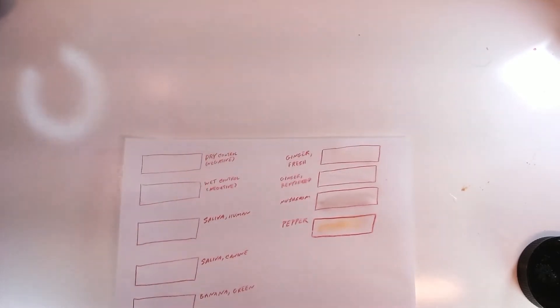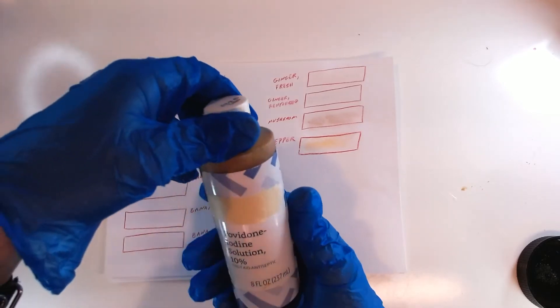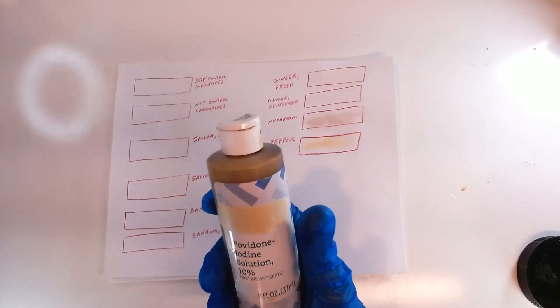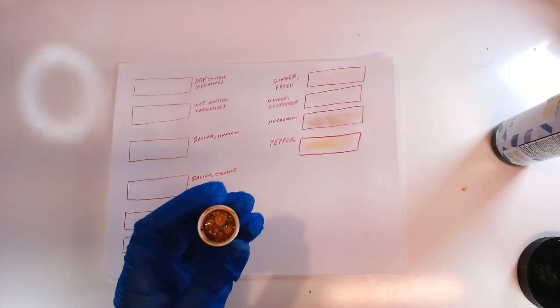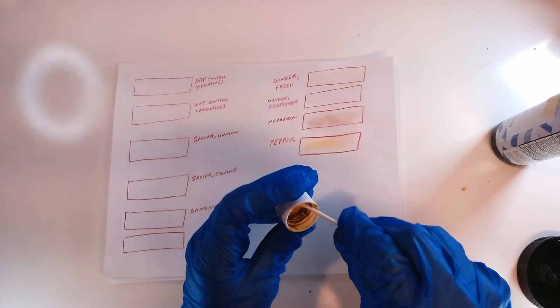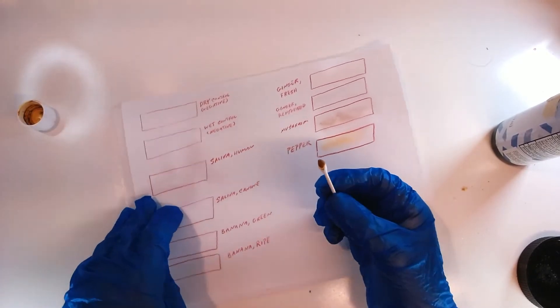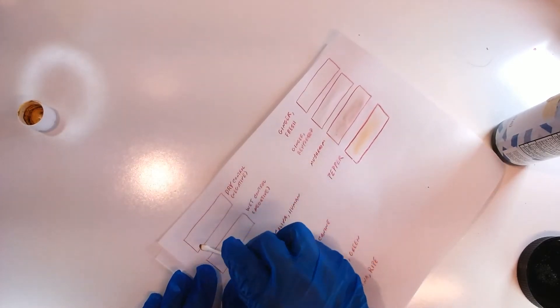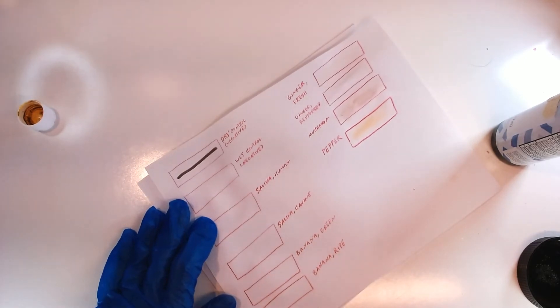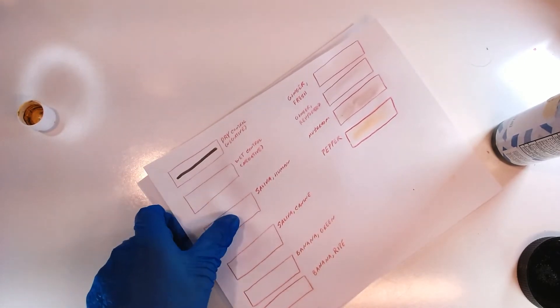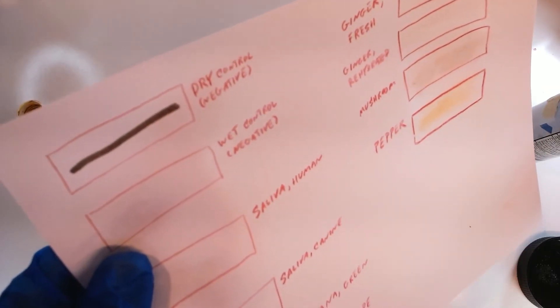Once all of the residues have dried on the paper it's time to apply our indicator, which is the iodine solution. To apply it I'm going to use a technique I learned from my old art teacher: make sure the cap is attached firmly to the iodine solution bottle, shake it up, then remove the cap, turn it upside down, and apply our q-tip to the inside of the cap. There's plenty of solution in there — waste not, want not. We're going to put one streak of iodine across each rectangle.